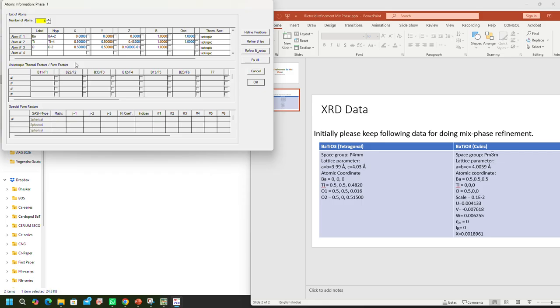So in barium titanate, the A and B axis and another one the C axis, you can keep 1.5 1.5, or you can also keep 1.8 1.2 depending on your crystal structure. So here I am placing 1.8 for O1 and O minus 2 for this, 0.5 0, 0.5 1.5 0 0, then again 1, and this is 1.2. So if you see here, overall the summation of these O1 and O2 is 3.